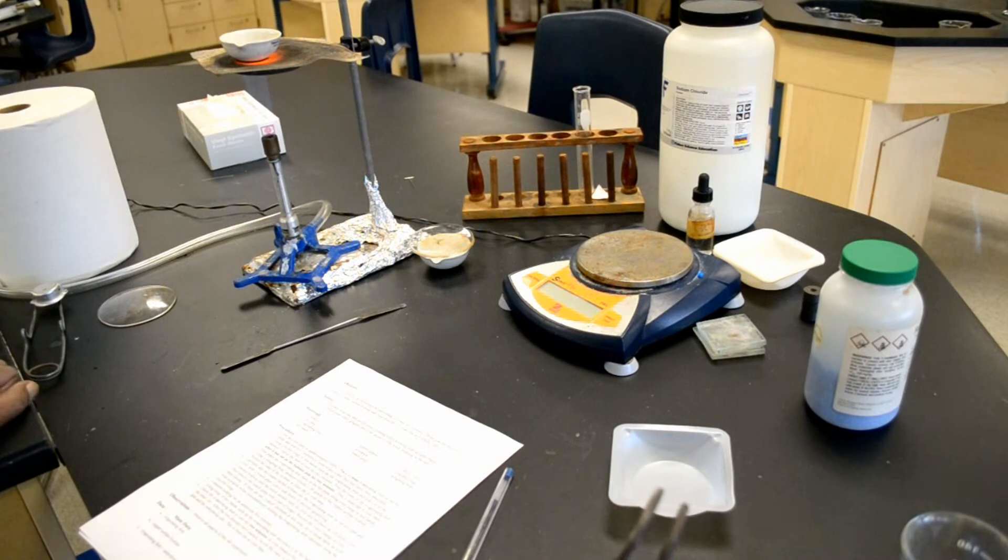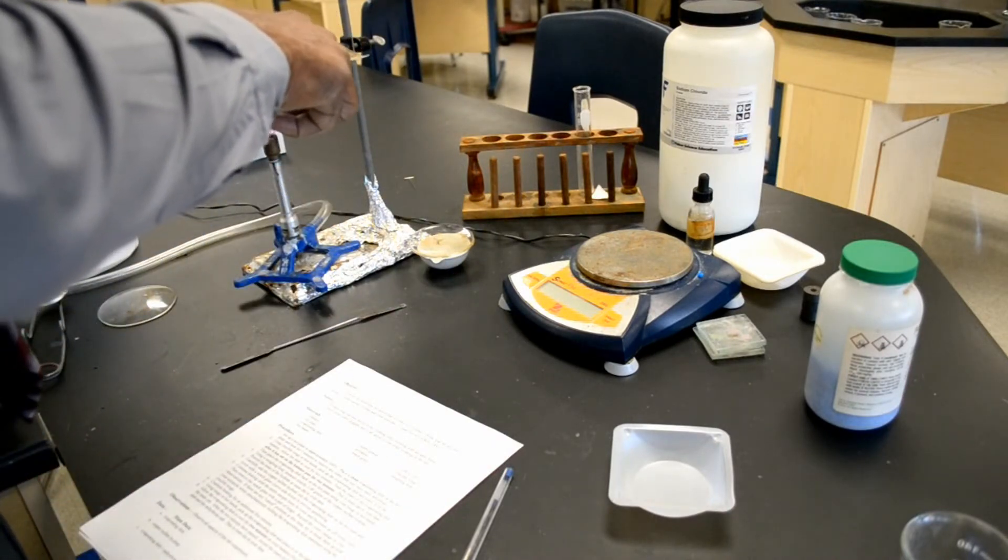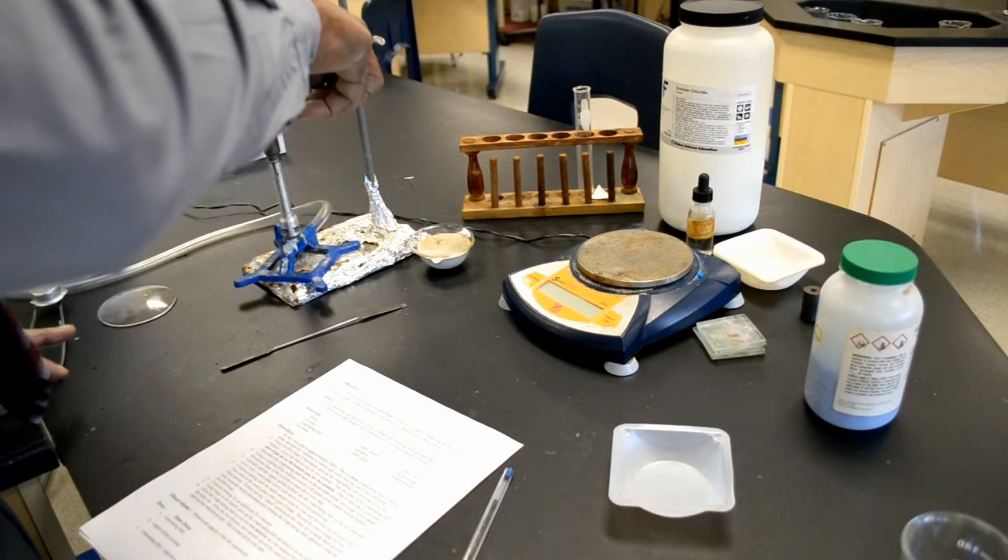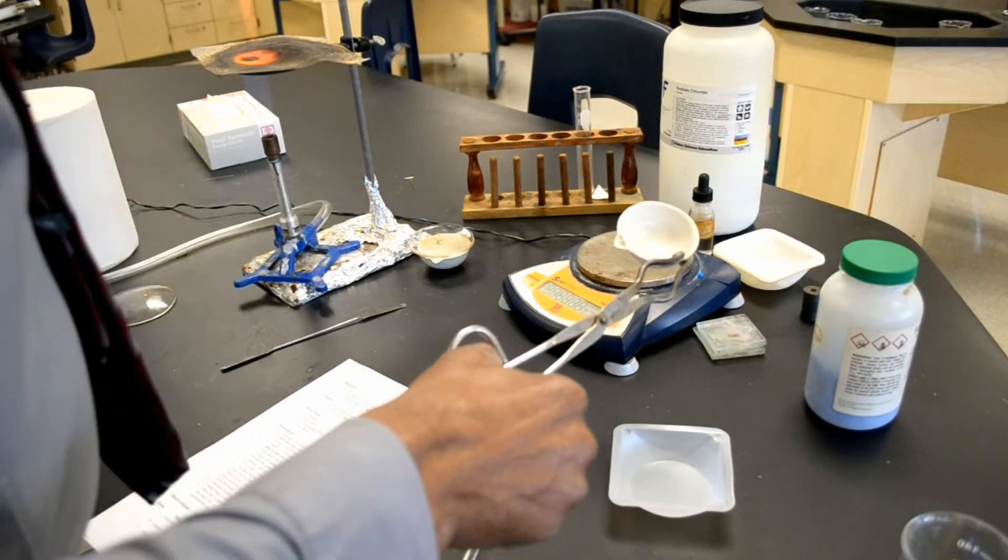Using crucible tongs or hot hands, pick up the evaporating dish and place it on a balance. I'm going to assume that four or five minutes has passed, I'm going to place my evaporating dish on the balance.